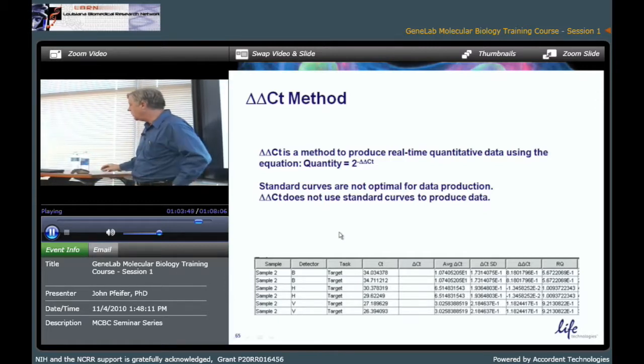On the other hand, if you're looking for, let's say, adeno in a liquid, maybe blood or something, in that case we would use an exogenous normalizer. So things like RNase-P, that's an endogenous typically. So exogenous would be like, we have an IPC, exogenous internal positive control. You could spike it in so many microliters per mL of blood prior to extraction. So that way, when you extract the DNA from the blood, the efficiency of extraction should be the same for the target and the normalizer, so it corrects out in the math.